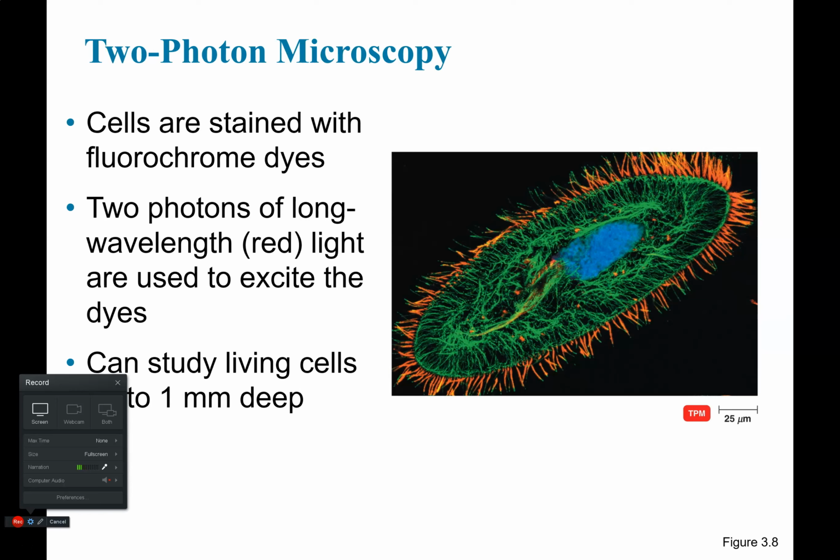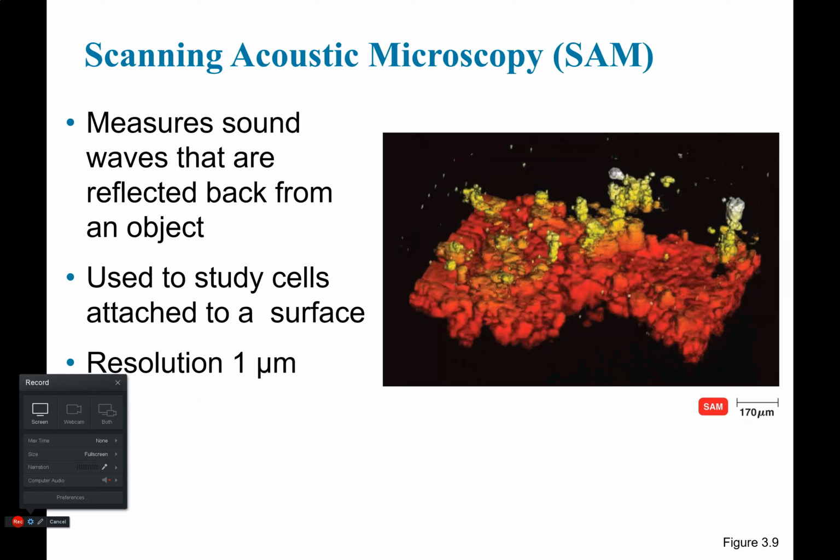And here's another one, even getting more powerful. Again, using fluorescent dyes, using different wavelengths of light. And again, it doesn't mention it, but I think most likely in conjunction with a computer. So those were all the types of light microscopy.